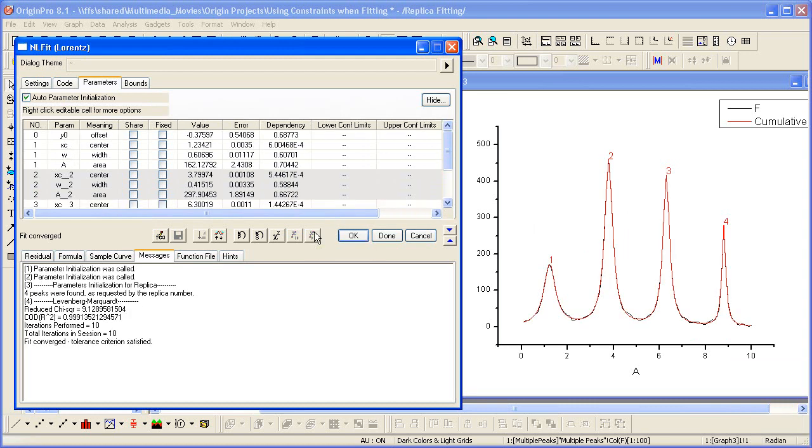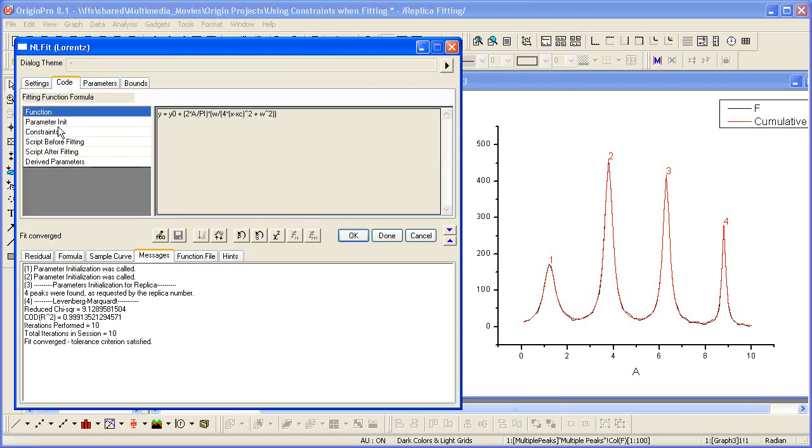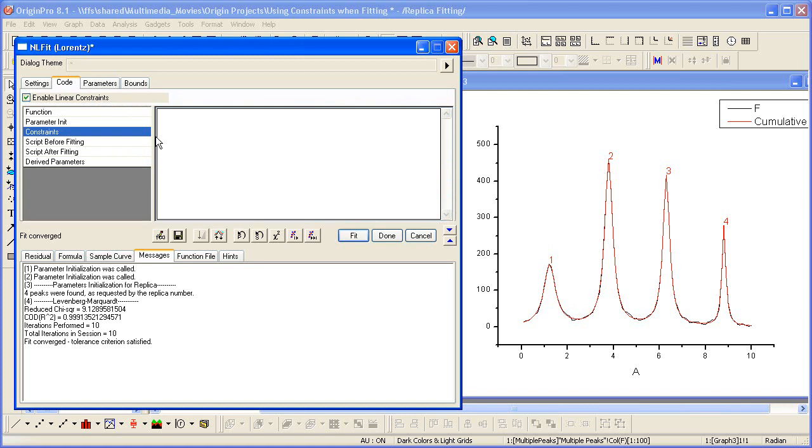Now let's say we wish to constrain the widths so that the width of each peak is less than or equal to the previous one. So we remember from the previous example that we go to the code tab, we select constraints, we enable them, and then we can enter them in here.